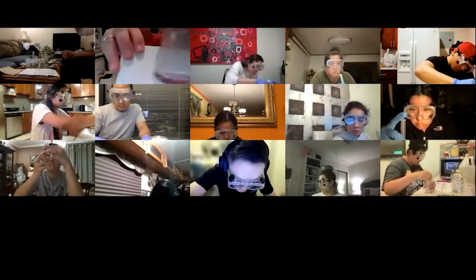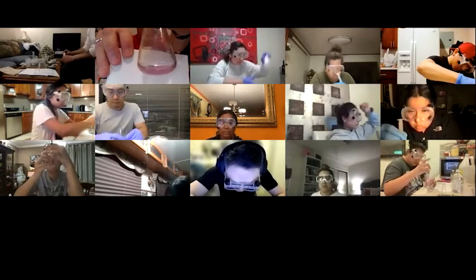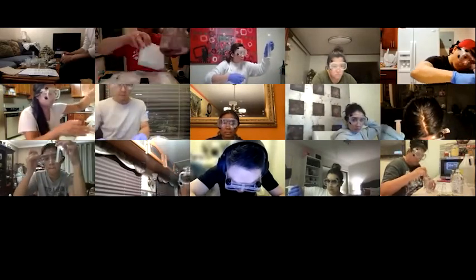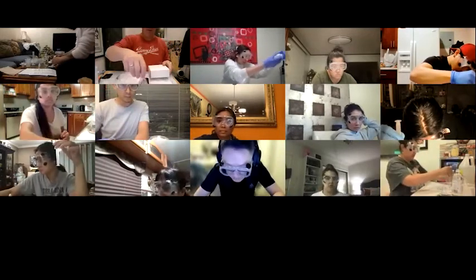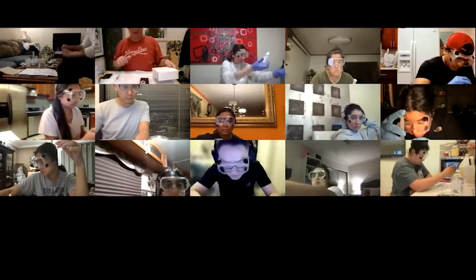So notice you get this little pink color where the drops were. And then when you swirl it, it goes away. So that's what you want. You want the color to go away. It was just a couple of swirls.